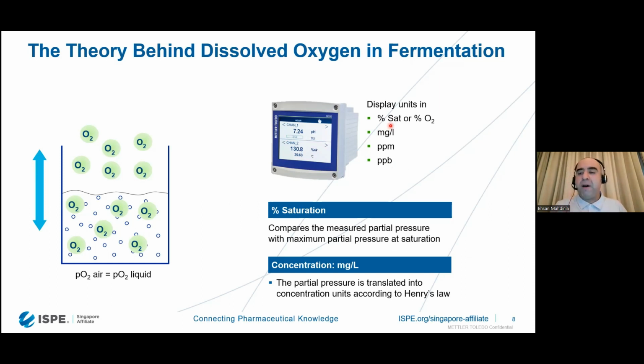So without the presence of dissolved oxygen, we calibrate the DO probe, and then with the presence of saturated oxygen under the conditions that we have, temperature, salinity, and so forth, upon that calibration, it is now relevant to those conditions. We can measure anything in between and report it as percent saturation. Because such a small presence of dissolved oxygen is not critical in upstream biomanufacturing, we usually follow such a relative measurement principle.